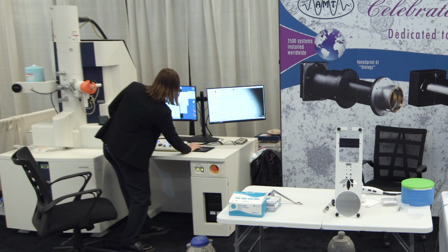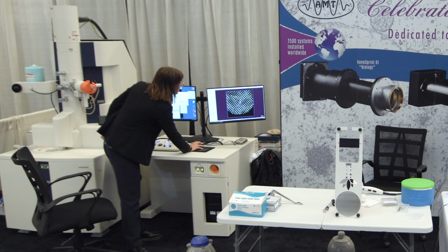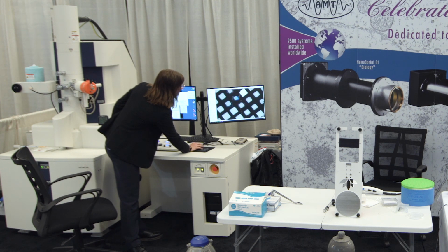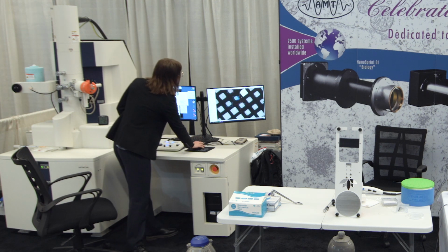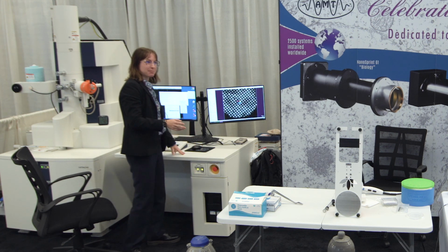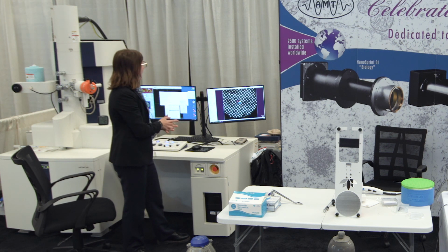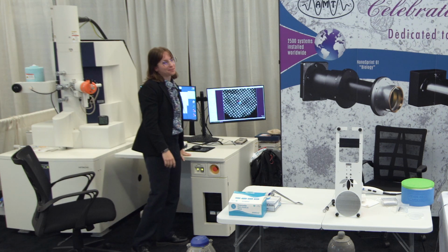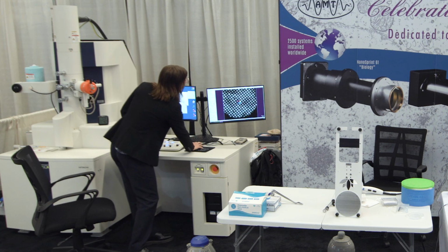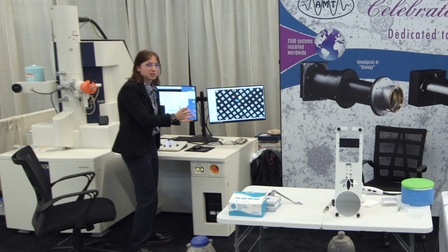Using SerialEM, I'm able to collect this whole view map of my whole grid. And then from my map, I'm able to zoom in to see which grid square has the best ice quality. Thankfully, I got very lucky. It's a high risk because a lot of the time you put in a sample and it's completely iced over and you're very sad and you have to do it all over again. So I got very lucky and had the luxury of picking the grid squares that I wanted. I had a whole bunch to choose from.